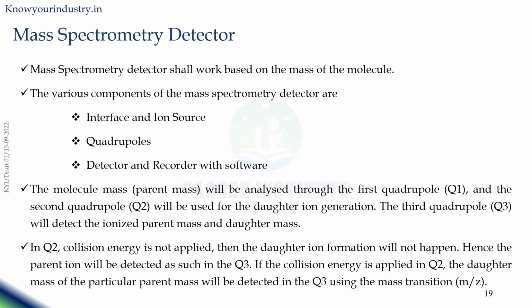So aspirants, so far we have seen, during method development using the liquid chromatography technique, the critical process selections like detector selection, mobile phase selection, and column selection.